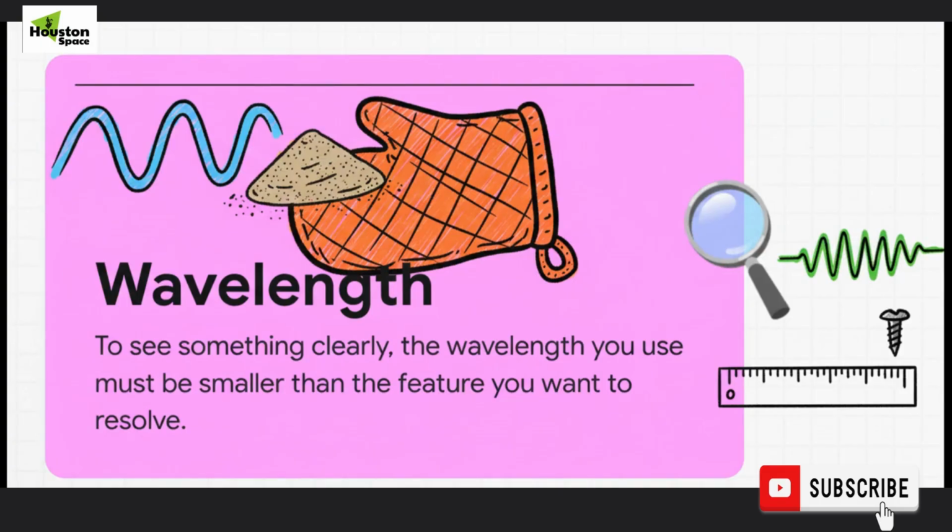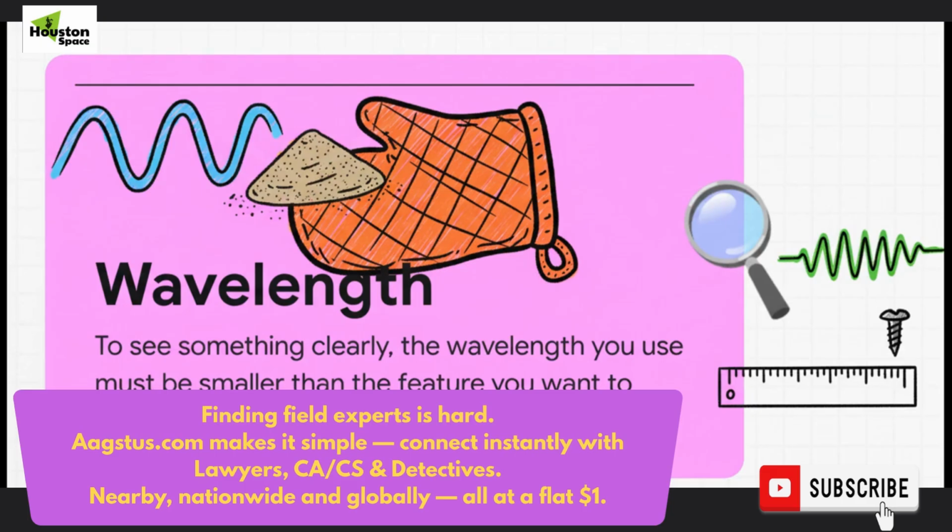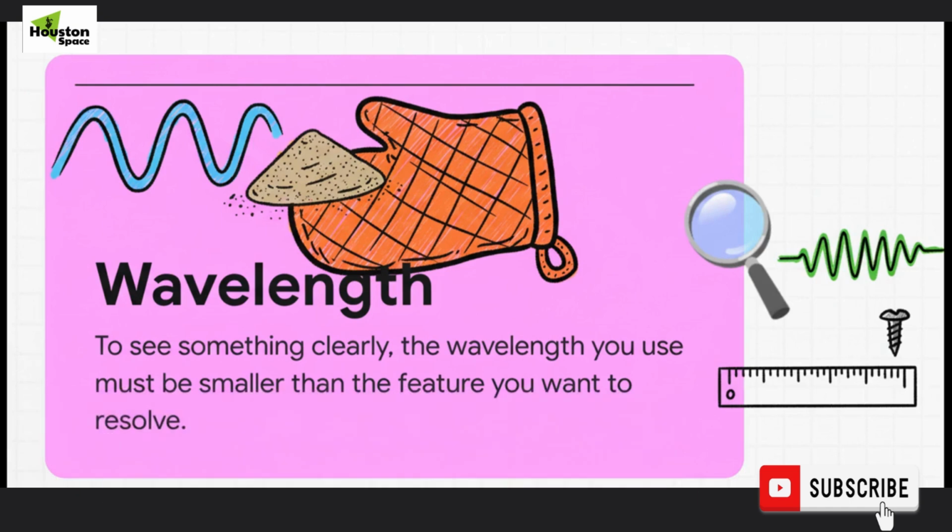Okay, here's a super simple way to think about it. Imagine you're trying to measure a really tiny screw. You can't use a ruler that only has markings for every inch, right? Your ruler's markings have to be smaller than the thing you're trying to measure. Well, in microscopy, the wavelength is your ruler's markings. And if the wavelength of light is bigger than the object you're trying to see, it's like trying to feel the details of a grain of sand while you're wearing a huge, thick oven mitt. The light wave just kind of washes over it without resolving any detail.